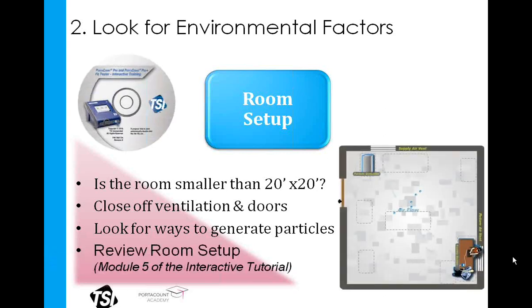I would also recommend referring to the room setup module within the interactive training tutorial. This will show how to best set up a room, such as placing particle generators under supply diffusers, not underneath return grills, where the particles will simply be removed from the room before being sampled by the PortaCount.